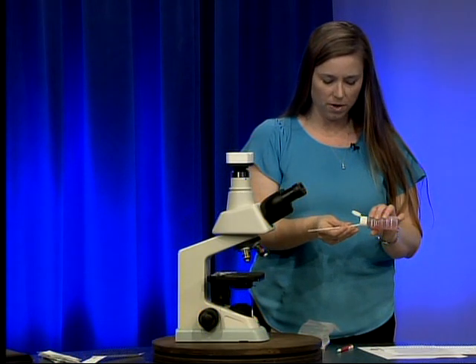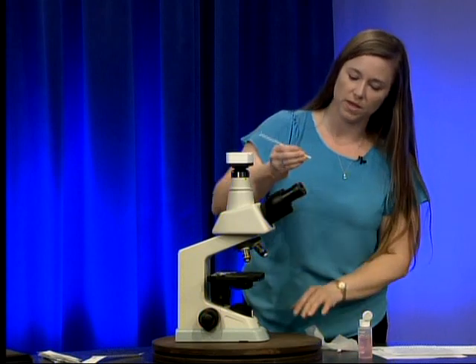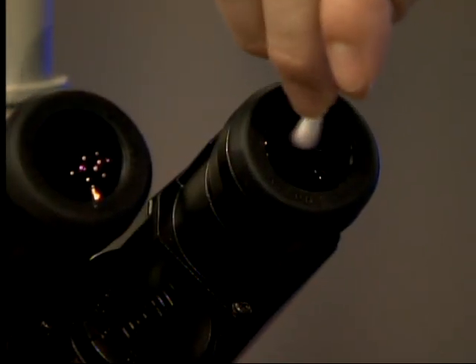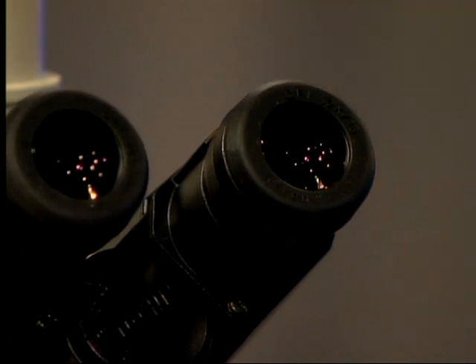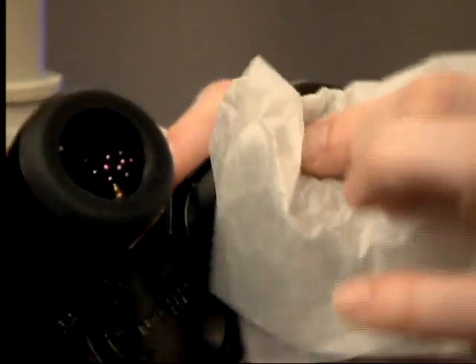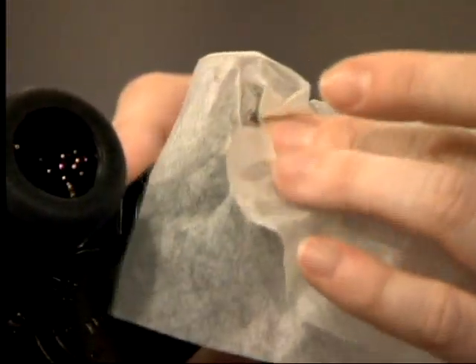I'm going to take my swab — I may need to add another drop — and do the same thing with the other eyepiece. Start in the center, work outward in a circular fashion to the outer edge, making sure not to go over a part already cleaned. Then use dry lens paper to buff it dry and remove all water spots.